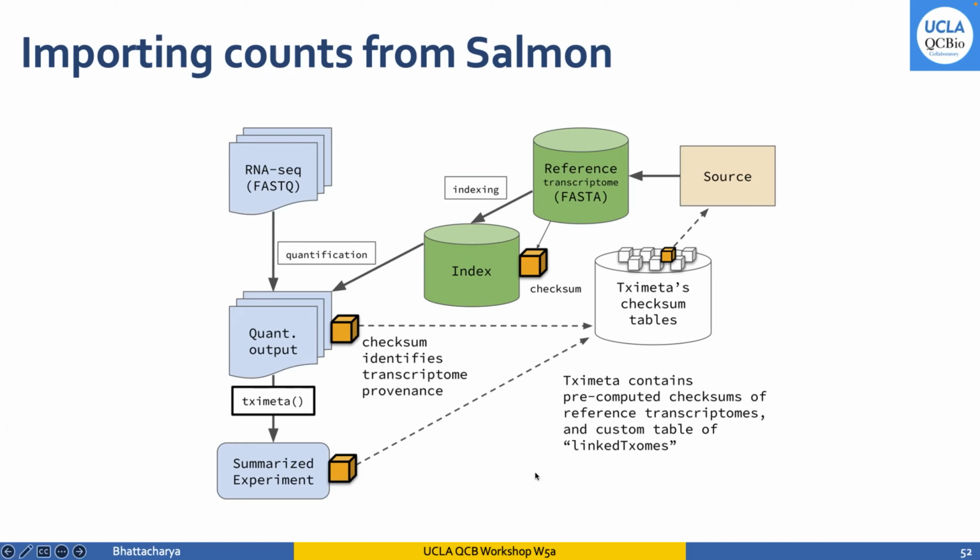This object in R is all you'll need to run these analyses on gene and or transcript level expression. Any questions about this? So this is the output data that will be used in all downstream visualizations and analysis. Yes, exactly.